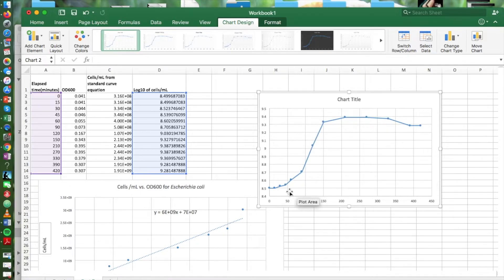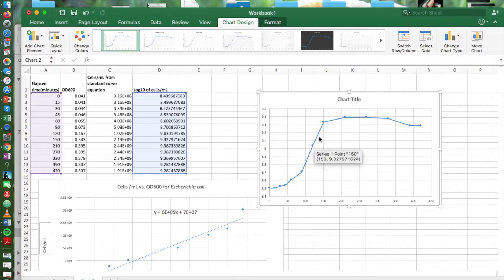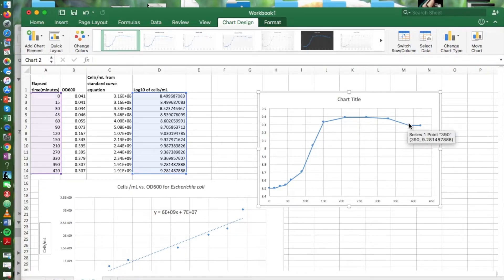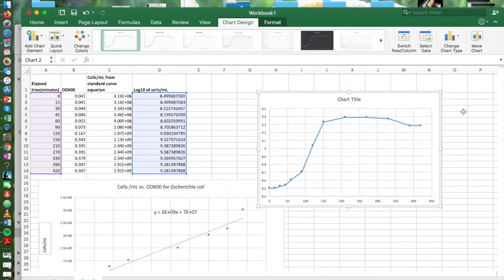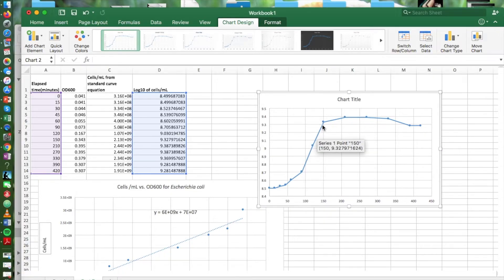On this curve we can pretty easily identify the lag phase. Here's the exponential phase. It's a straight line. The stationary phase and then growth drops off into the death phase as the bacteria start to die.